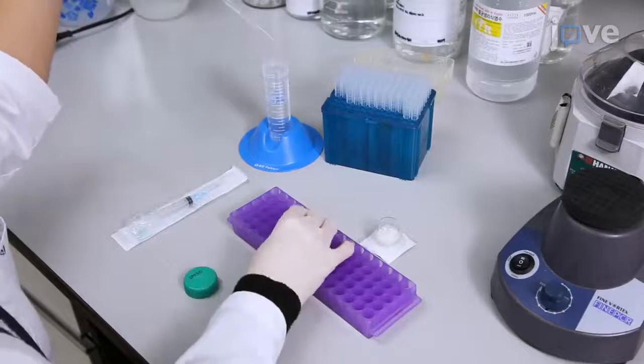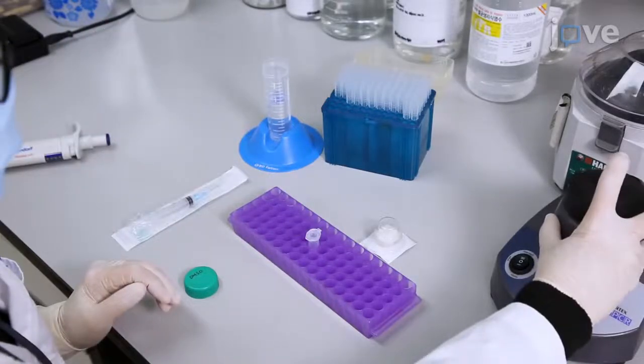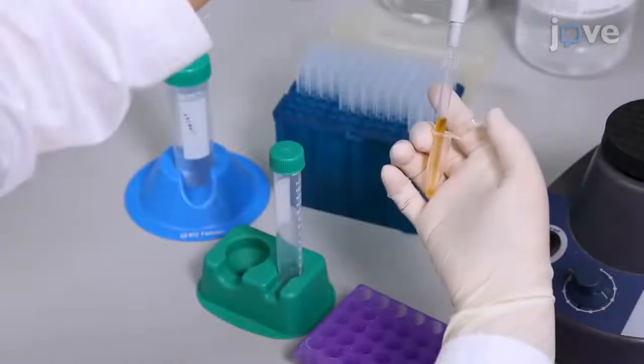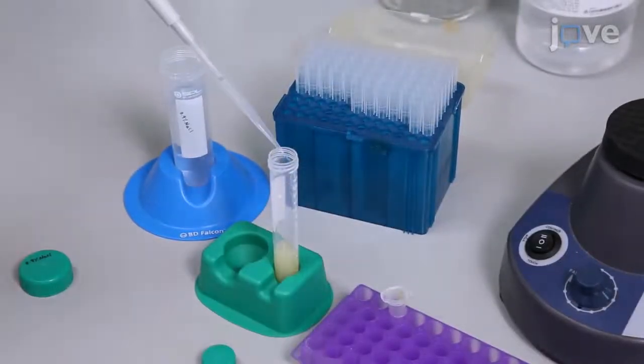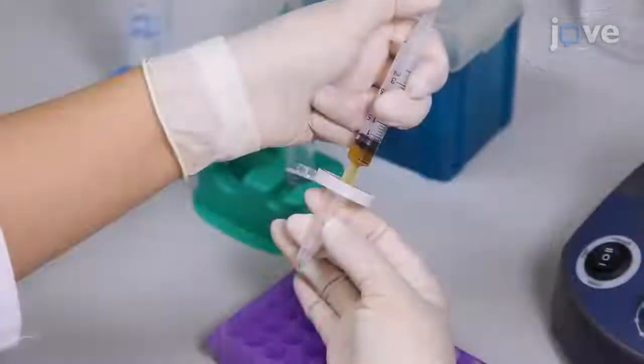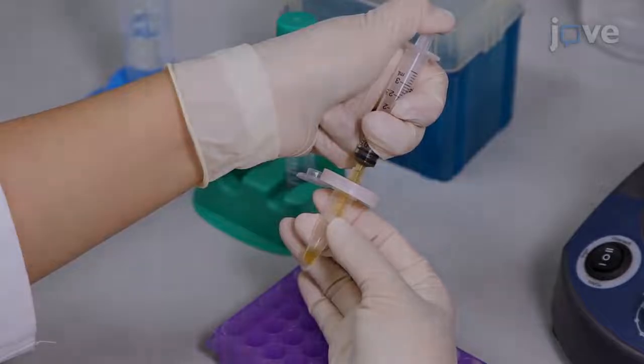To prepare the GREX for administration, dissolve the freeze-dried product in dimethyl sulfoxide and dilute the mixture with 0.9% physiological saline. Then filter the solution through a 0.45 micrometer syringe filter.